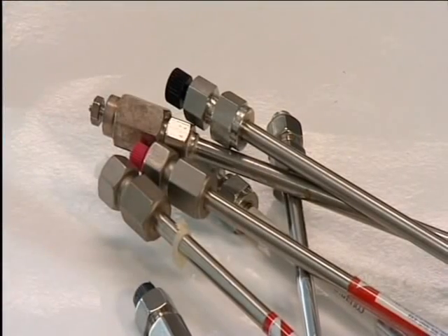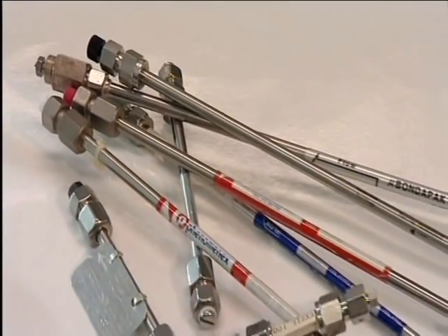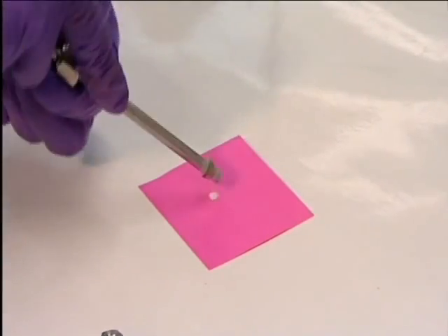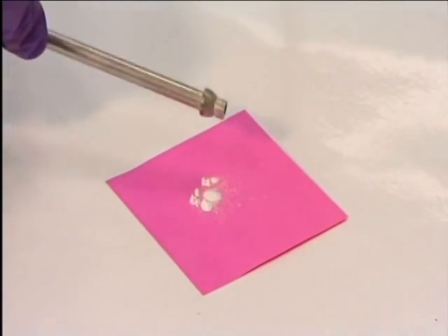In HPLC, the stationary phase is a solid packed into a column, like one of these. This particular column contains silica particles to which C8 hydrocarbons are attached, making the stationary phase nonpolar.